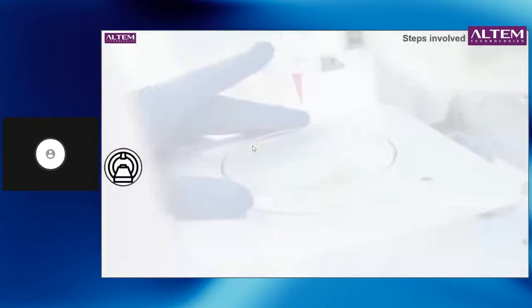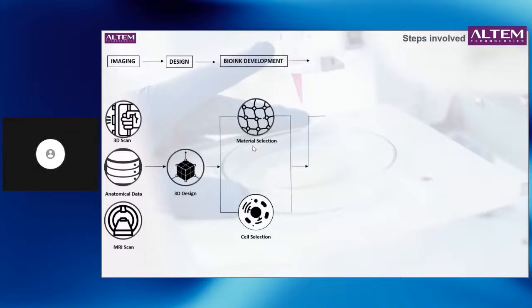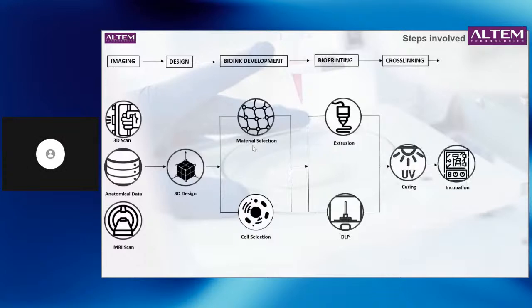And the reason I've included this step is because you'll see how biomaterial development plays a very important role in collaboration with having the right type of bioprinter with you that can give you the type of material that you want eventually for your application. So there is a very close correlation in the bioink development sector when it comes to doing bioprinting, and we have quite some experts in the field who are well versed in bioink development, maybe for bioprinting.